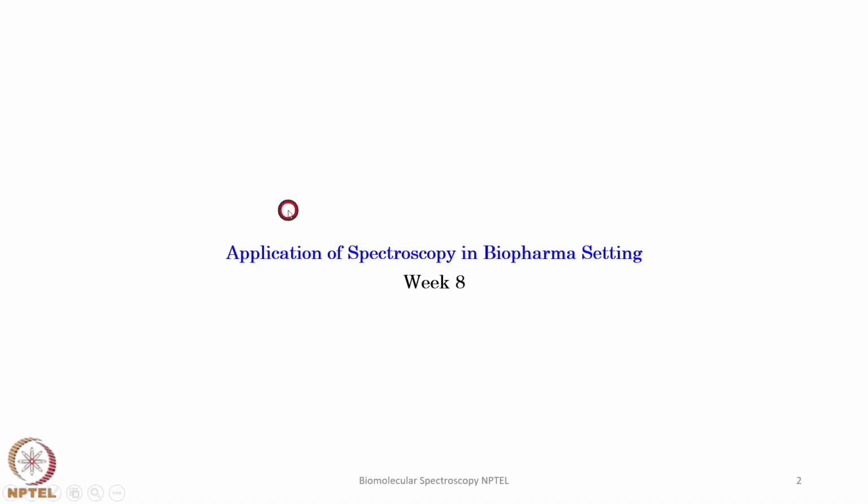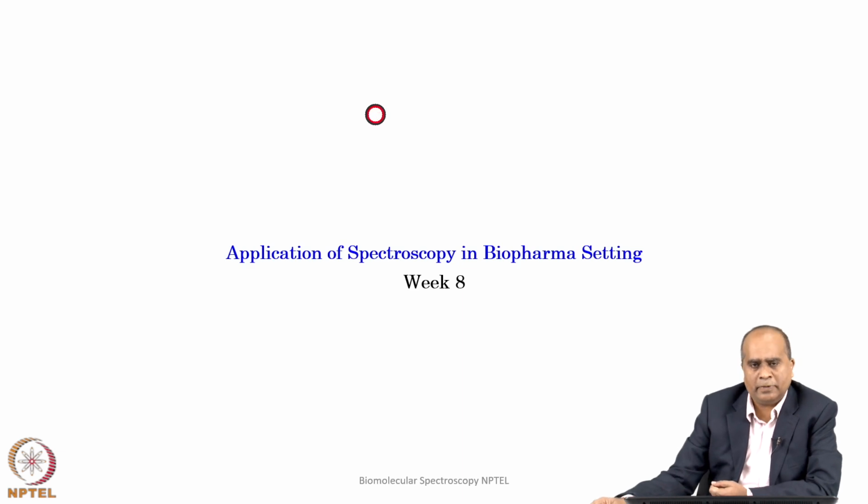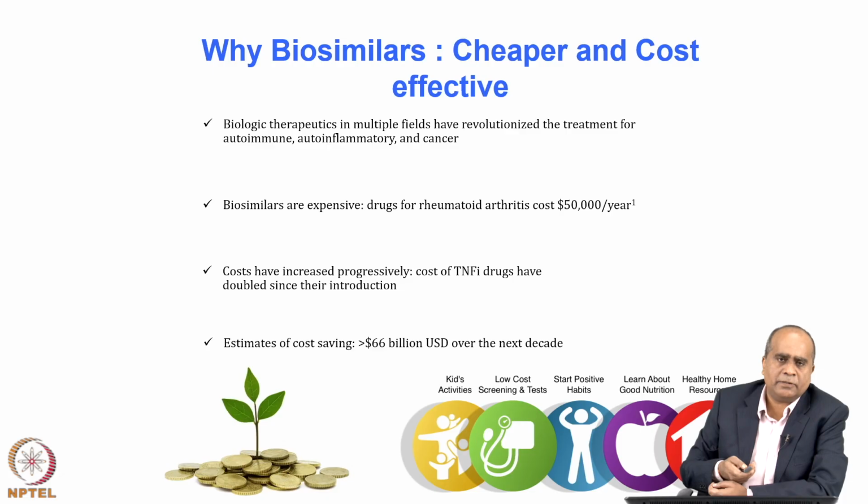Good morning students, welcome to the next lecture of biomolecular spectroscopy. In this lecture we were discussing the application of spectroscopy in a biopharma setting. In the last lecture I gave you examples of where we will be using UV-visible, where we are going to use CD, fluorescence, FTIR and Raman, and we also discussed a case study for that.